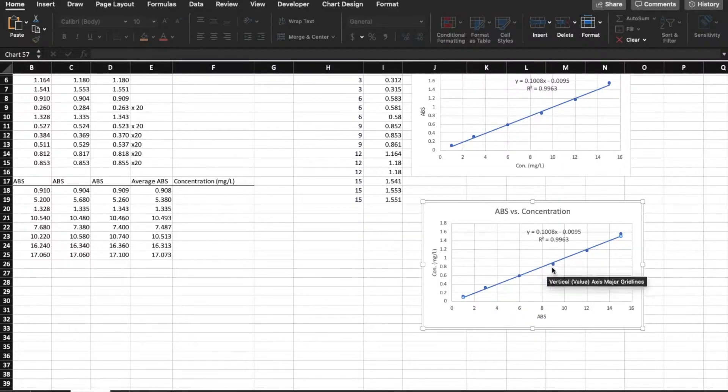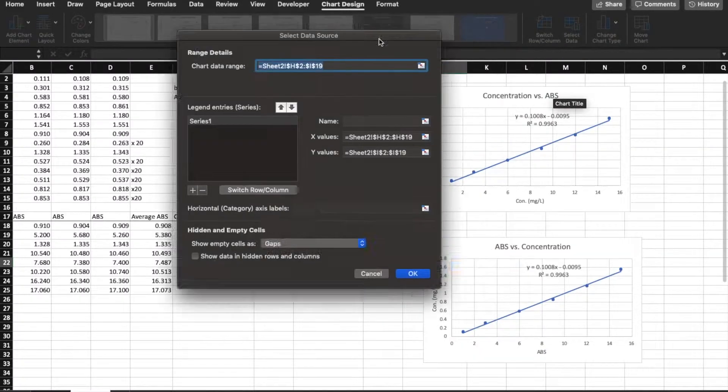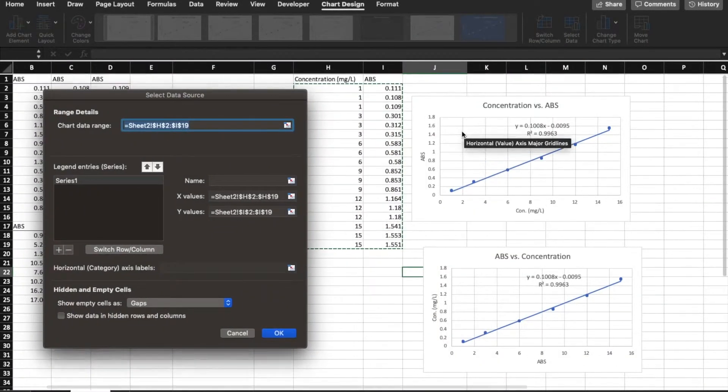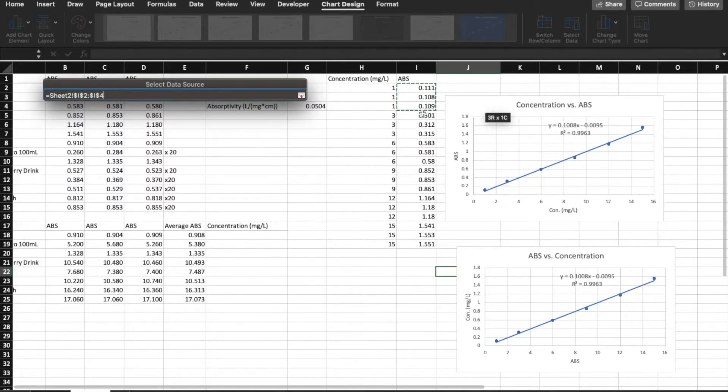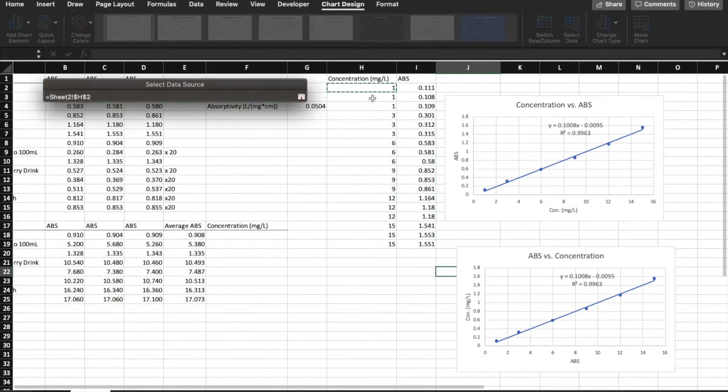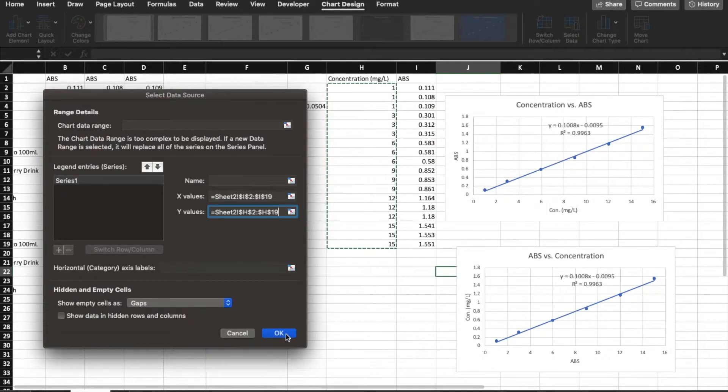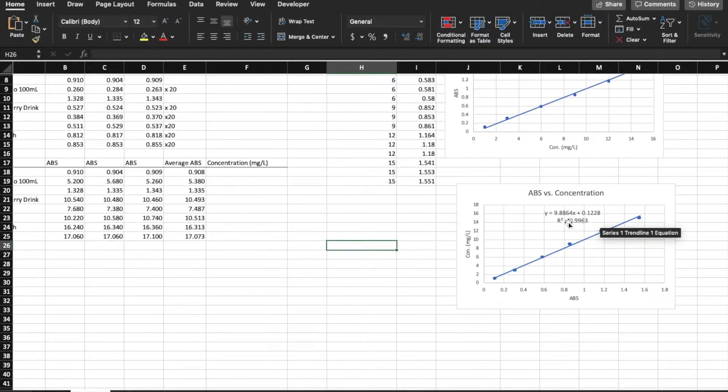So all I'm going to do is, when I click on this data, I can go to the top to chart design and I can click on select data. And I can actually switch my x and y axis. So for my x values, I'm going to choose my absorption. And then for the y values, I'm going to choose concentration instead. So then this will pretty much just flip the graph. It will give us a different equation. And now we're going to use this equation to find concentration. So this equation, if you plug in absorption for x, you'd get a y answer of concentration.